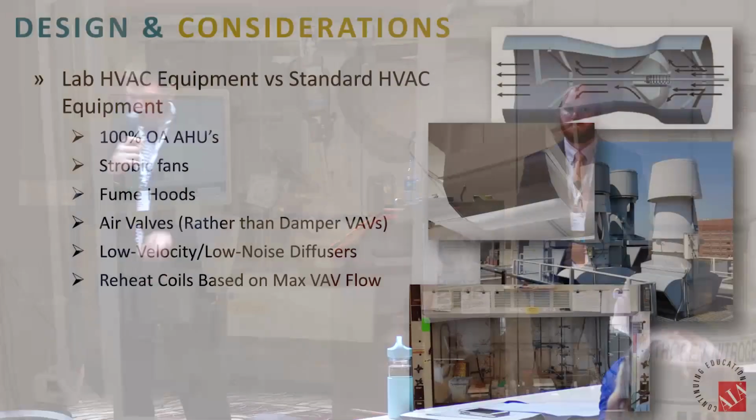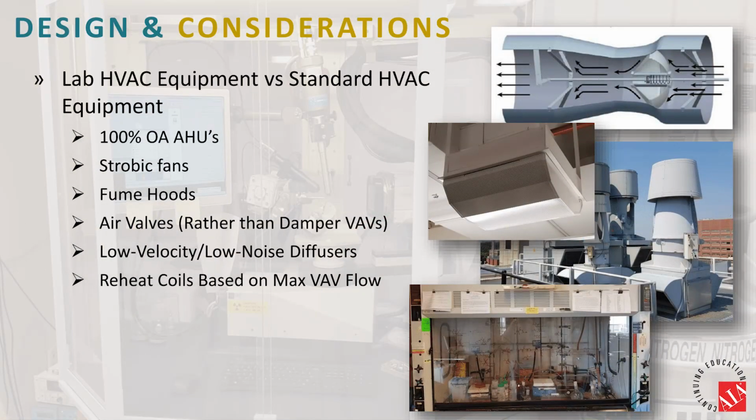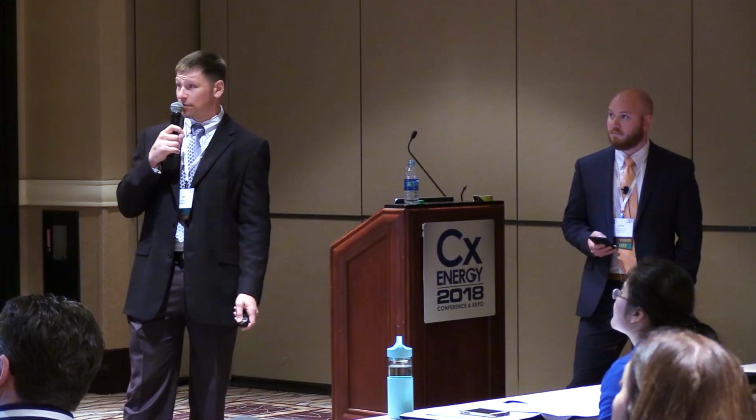A lot of times, they are legitimate, but they come in and the ductwork and the layout and everything, there's a system effect. So just because the valve came from the factory calibrated, doesn't mean you don't have to test it when it's first installed. And now here we are years down the road. Well, we want to test it again, see what it's actually doing. So we've got all these different things to consider when we're doing this. We've got different types of equipment. We're going to talk about the strobic fans a little bit. We're going to talk about the upblast and the bypasses and all these things and how they can affect a lot of things going on in these labs.